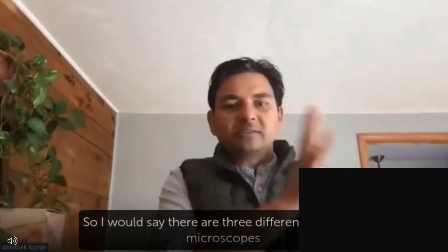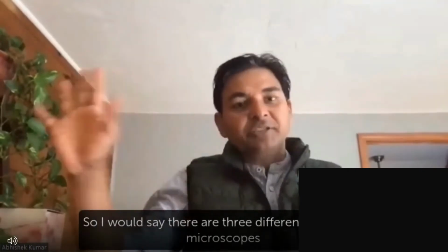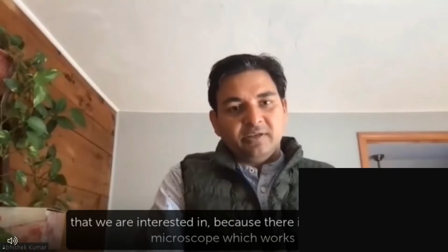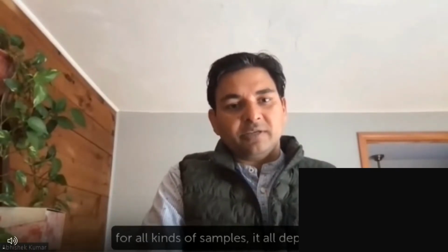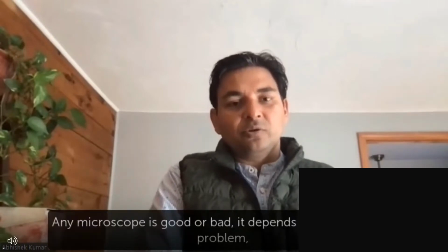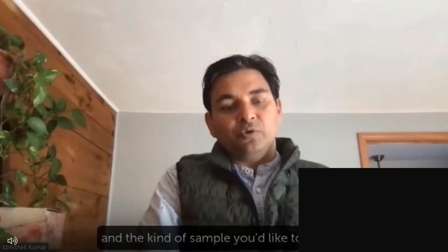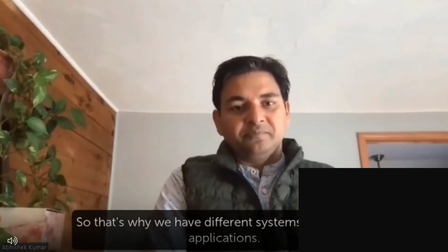So I would say there are three different light sheet microscopes that we are interested in, because there is no universal microscope which works for all kinds of samples. So it all depends. Any microscope is good or bad depending on our biological problem and the kind of sample we would like to image. So that's why we have different systems for different applications.